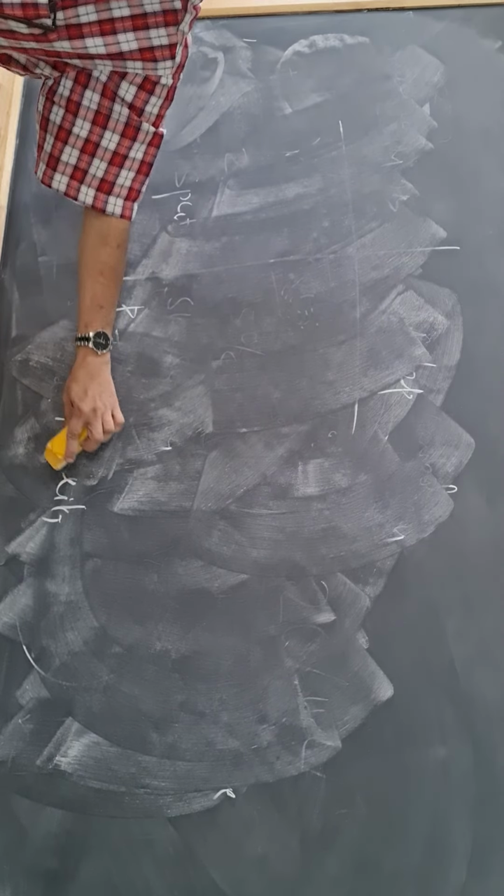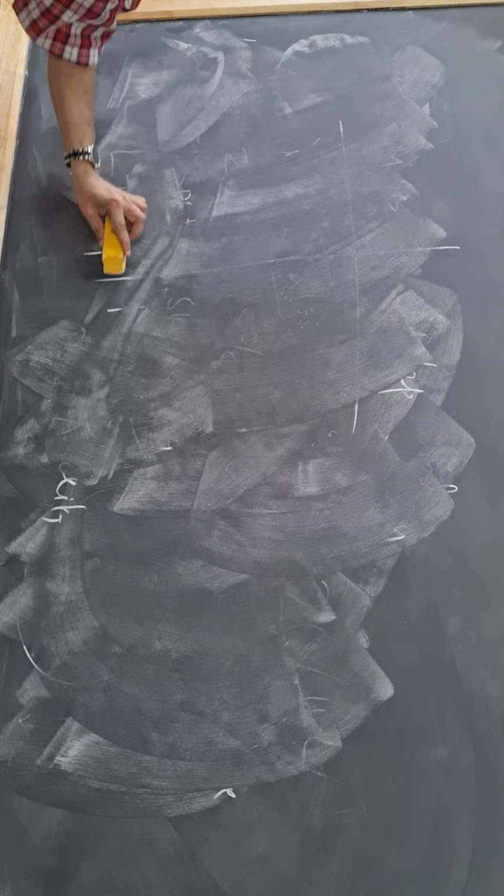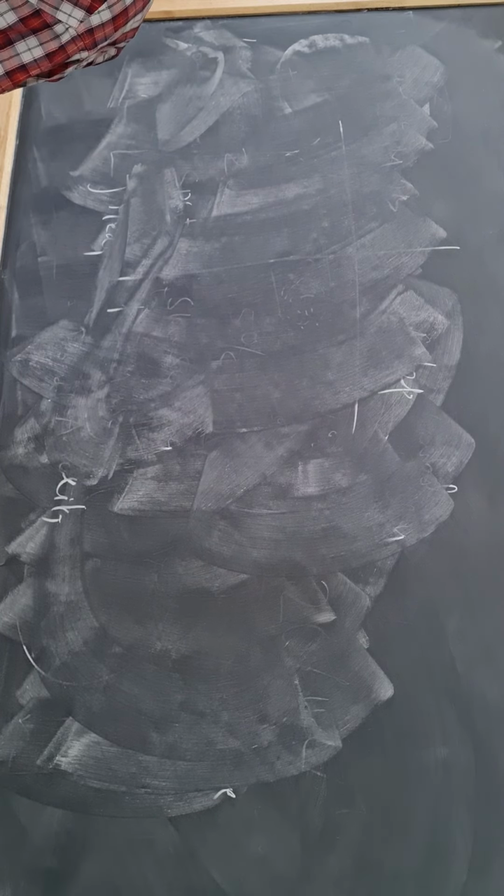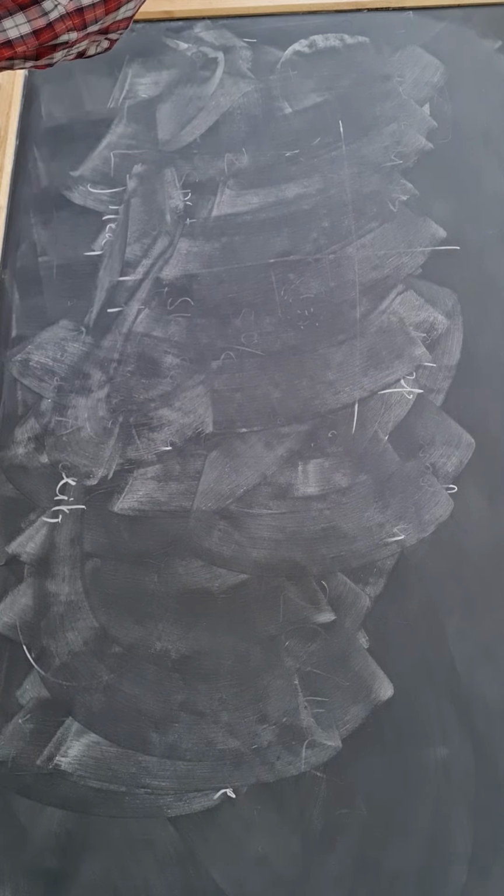So once again I'll repeat the procedure. Take the smear facing upwards. Most of the students stain on the reverse side of the smear and end up breaking the slide. Please don't make that mistake in the examination. Cover the smear with concentrated carbol fuchsin. Heat it intermittently for 5 to 7 minutes, taking care not to break or char the slide.